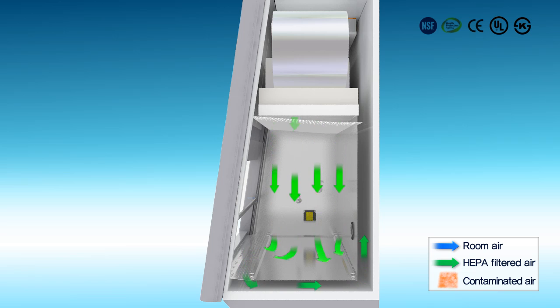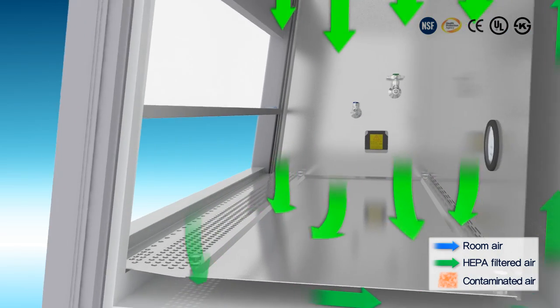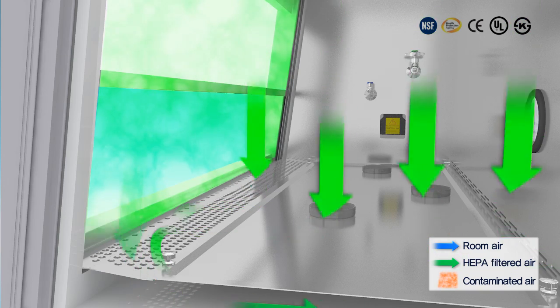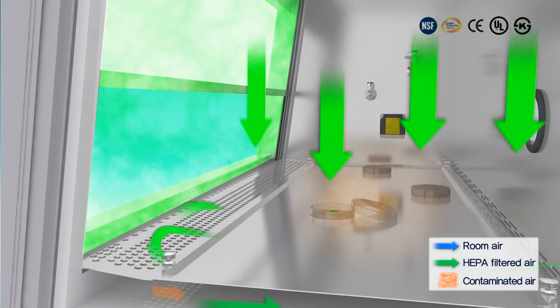The air supplied to inside chamber protects the researcher by forming an air curtain on the front space of the biological safety cabinet.